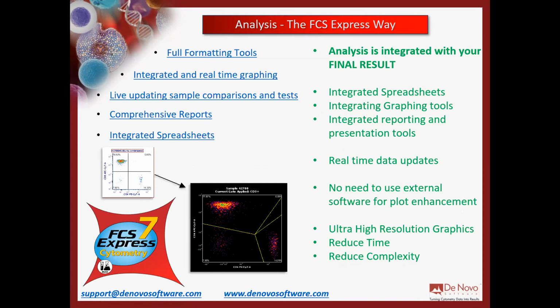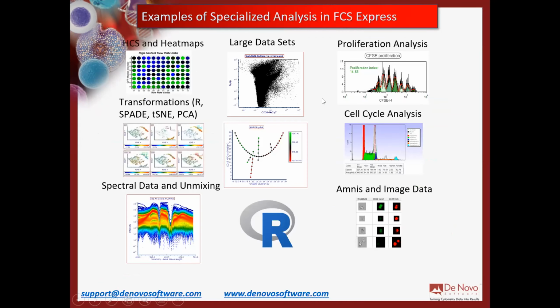One common thing I hear is that the publisher calls for, say, something silly like 378 DPI. They always come up with something. We have settings in FCS Express where you can change the resolution of your exports to 378 DPI. So if the reviewer comes back and says they need something very specific, you can simply go into FCS Express and change the setting, and that's going to reduce time. It's going to reduce complexity for getting together your final results.